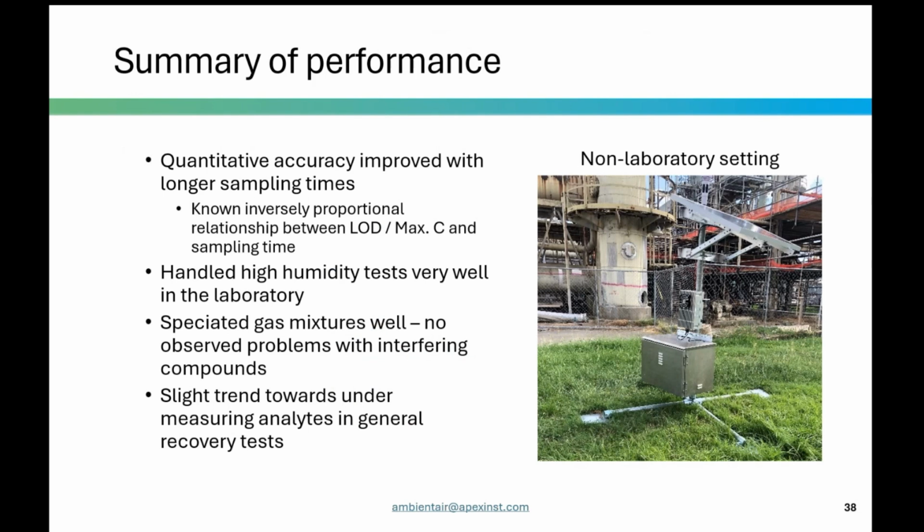To summarize all of the tests that were run, we observed very strong quantitative accuracy, which generally improved with longer sampling times. Again, we expected this due to the inversely proportional relationship between limit of detection or maximum concentration and sampling time.